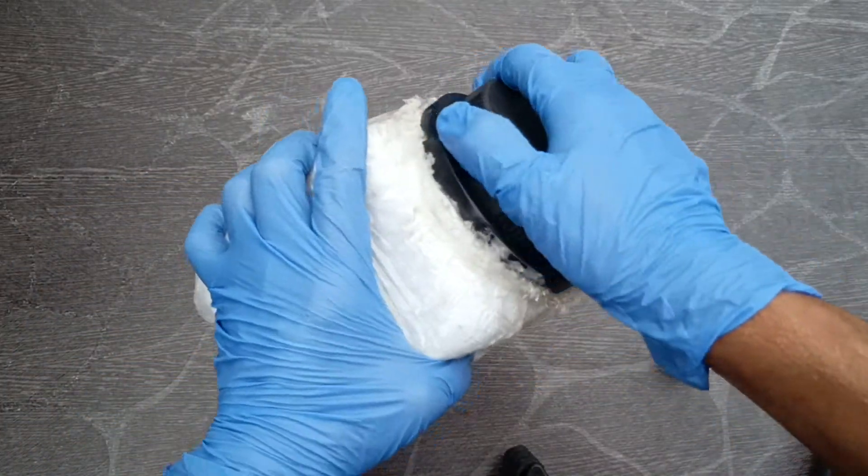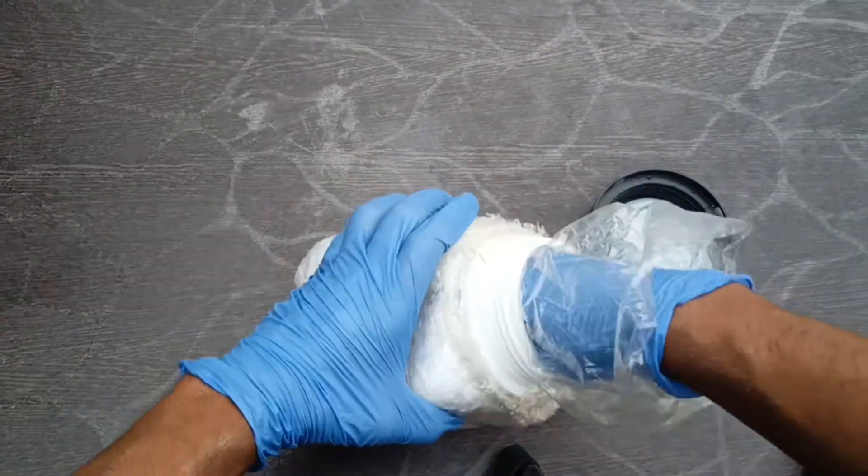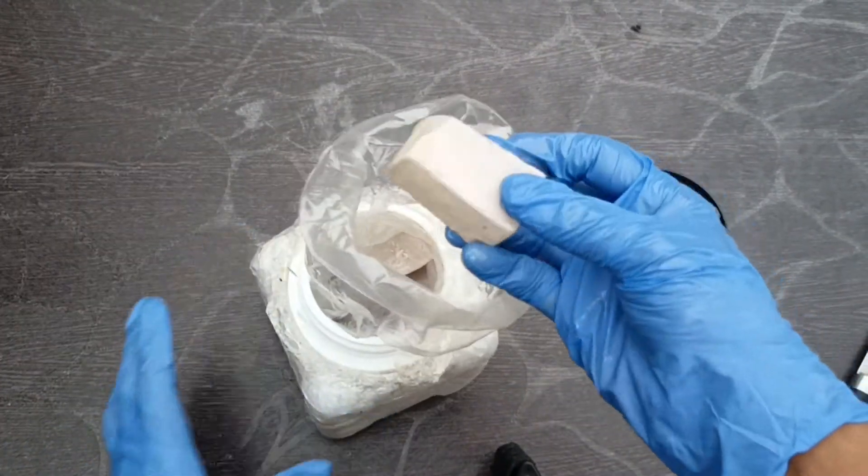This bottle contains sodium metal. It's usually stored in mineral oil. See how good it looks. Beautiful, right?